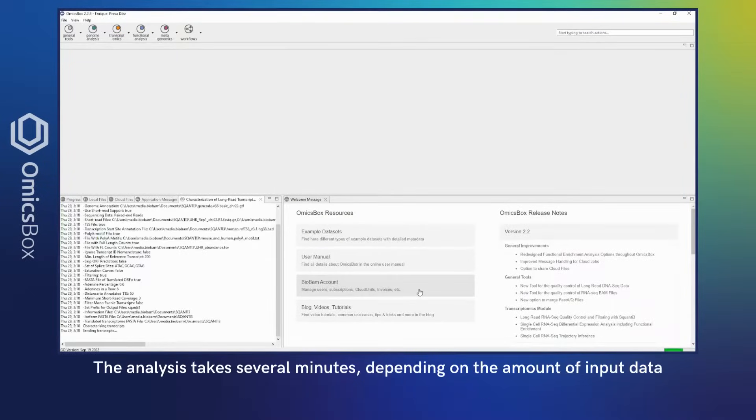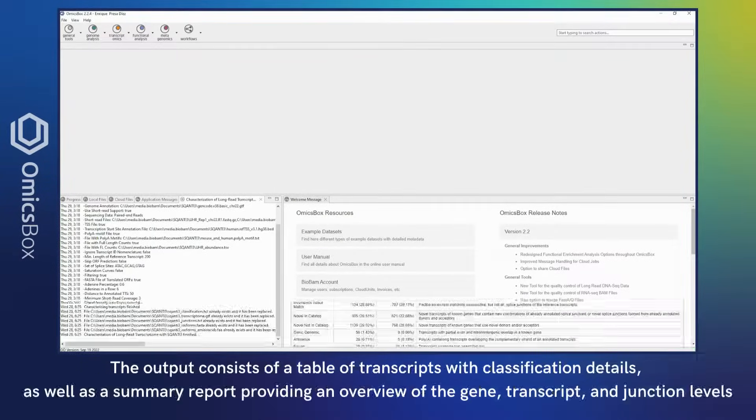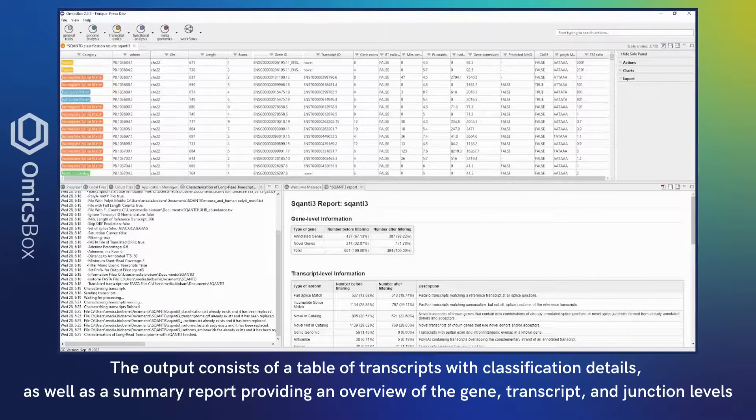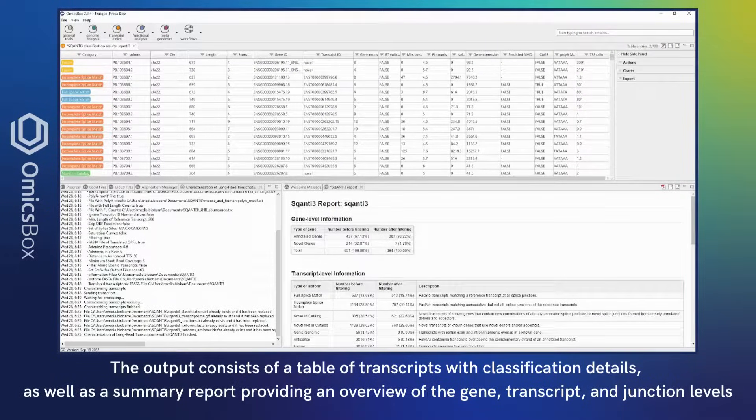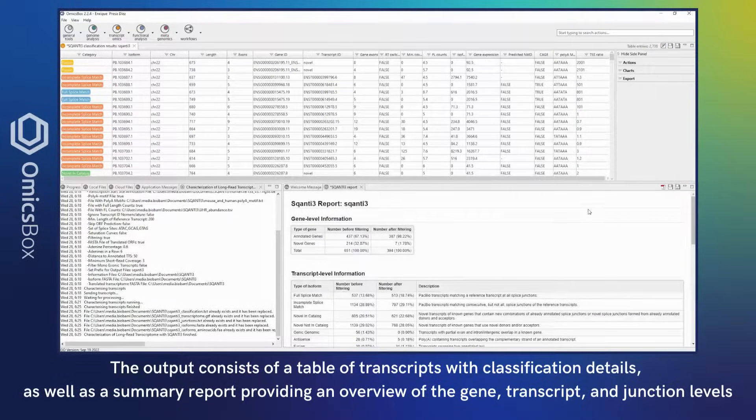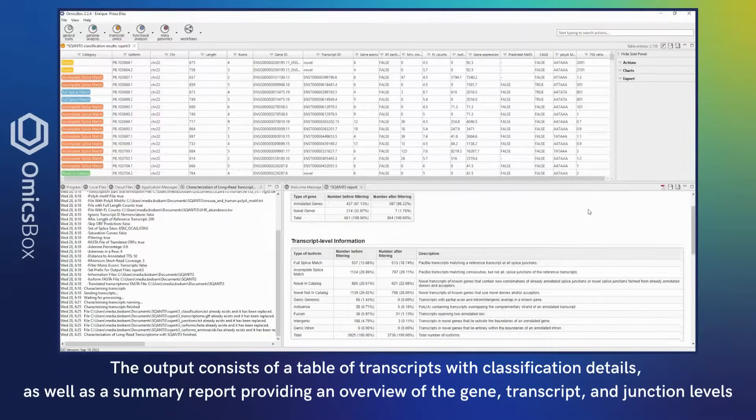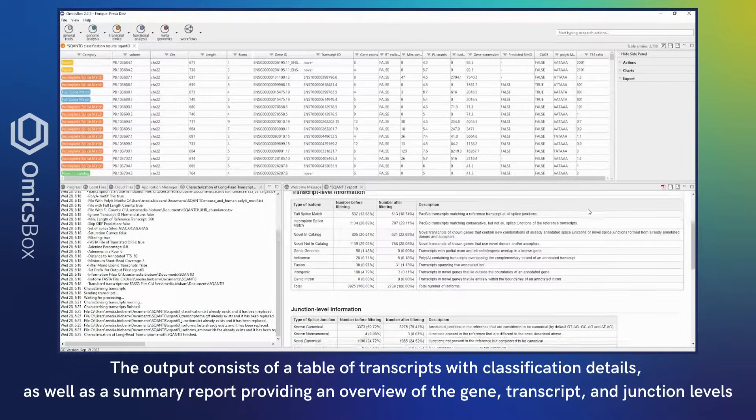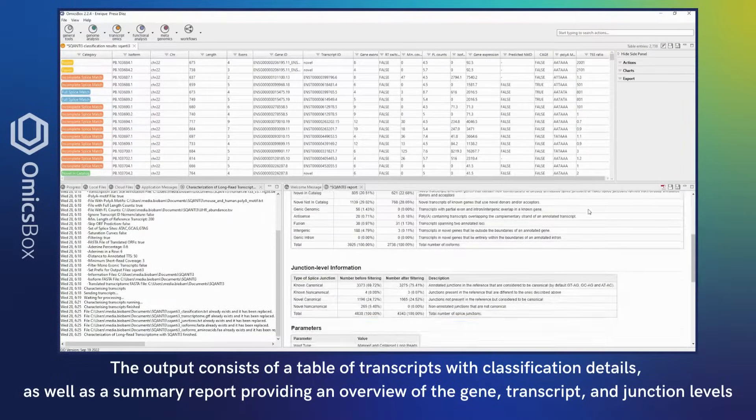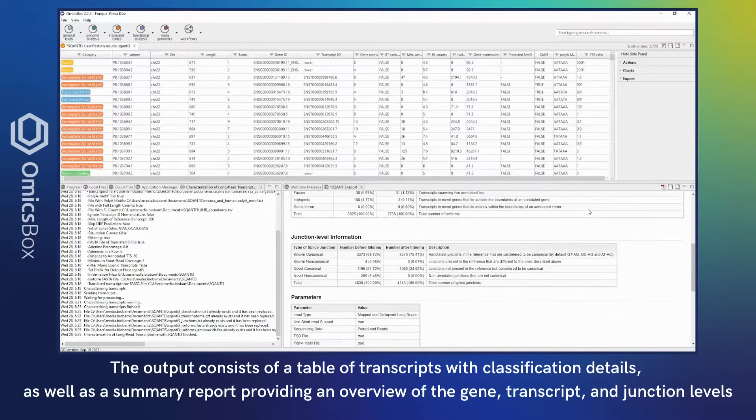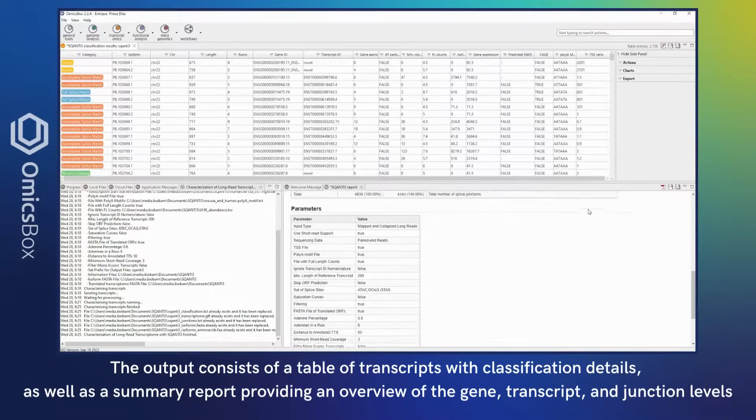The analysis takes several minutes, depending on the amount of input data. The output consists of a table of transcripts with classification details, as well as a summary report providing an overview of the gene, transcript, and junction levels.